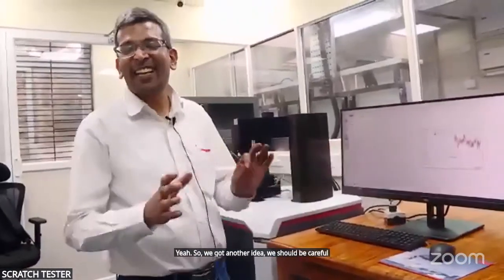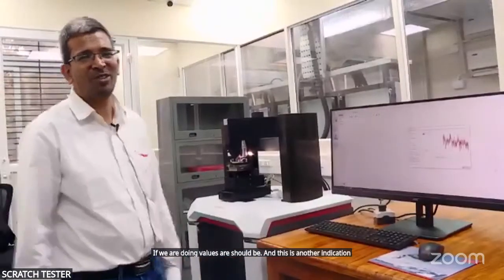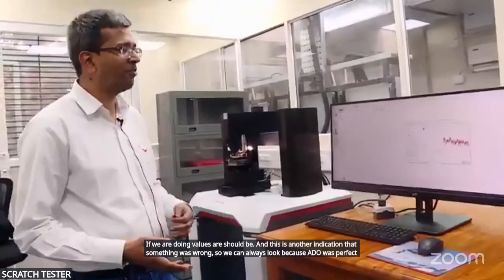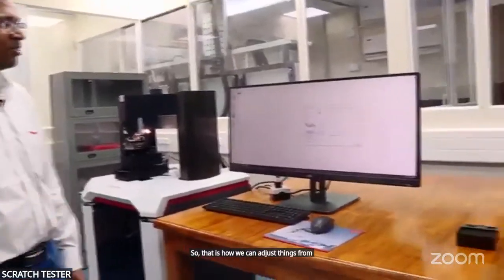So we got another idea. We should be careful while checking everything. If we are doing values, they should be right, and this is another indication that something was wrong. So we can always look, because ADO was perfect, everything was perfect. That means something which we put in the parameters was wrong. So that is how we can adjust things from our data also.